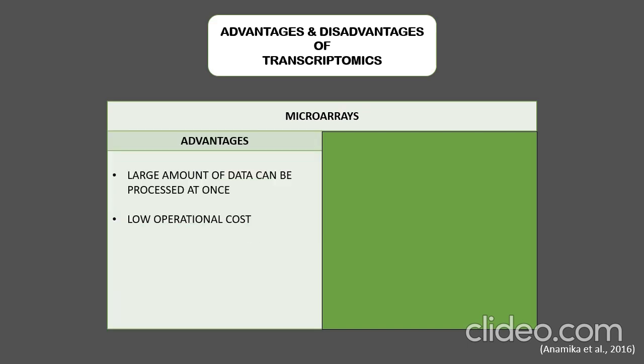Some notable advantages of microarrays are that this technique allows us to produce a large amount of data at once. And also the operational cost of microarrays compared to RNA sequencing is significantly lower. So we can save a huge amount of budget if we use this technique.